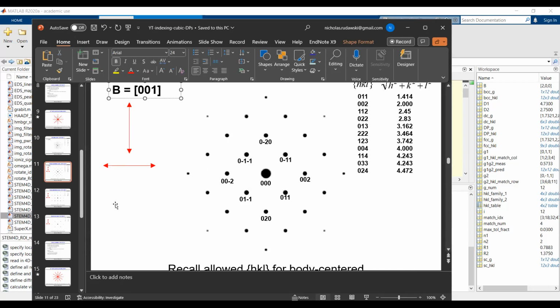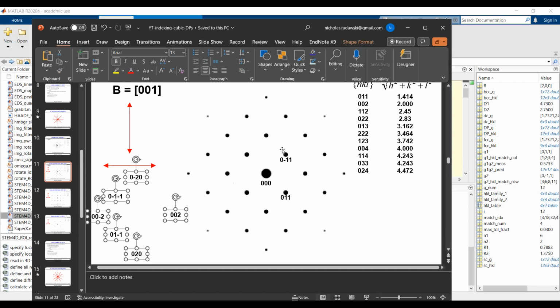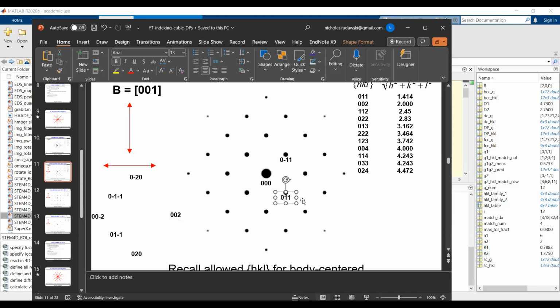Now we have to reassign indices to these two spots such that I get a 0 dot product, because right now I'm not going to get that. So I could call this one 1, 1, 0.